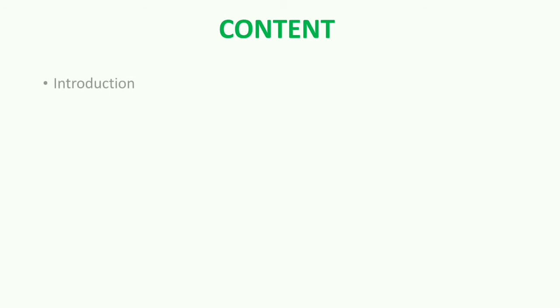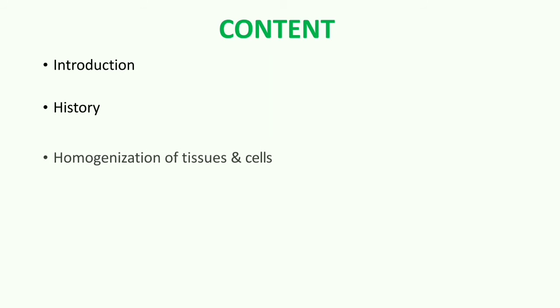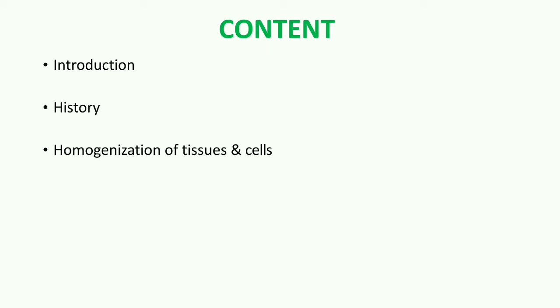In this video, I have included a general introduction for different methods of cell fractionation, history of cell fractionation, the types of homogenizers used for bringing about cell disruptions of tissues and cells, as well as a general summary of the cell fractionation process.